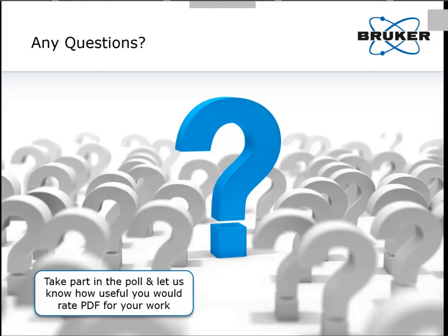We have another question that goes a little bit in the same direction on what you already touched on, Michael, and that is asking about the background correction for the PDF analysis. Maybe you can expand a little bit more on how we measure the background and what that background is. Is it the empty instrument? Is it the sample holder? How does that work?